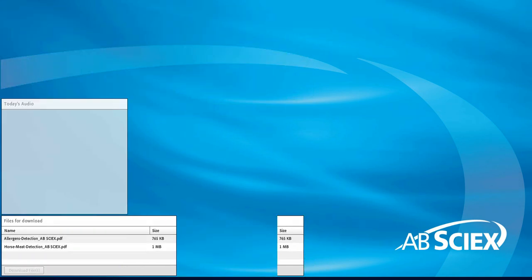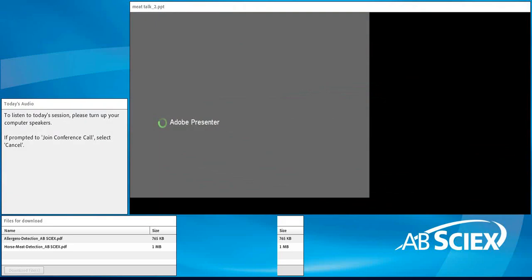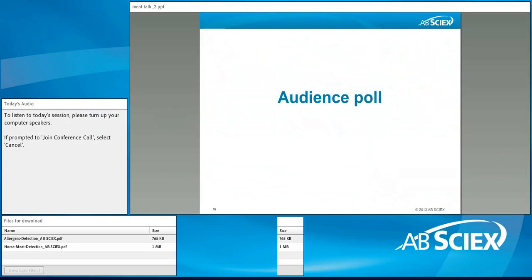This is very early results, and we can always add more drugs, vet residues into this method, because we're using a standard SPE protocol, which tends to trap a lot of these vet residues on the column. This will help us get down to detections for vet residues as well. So it's good to know that we're working in the right direction here for developing solutions for customers.